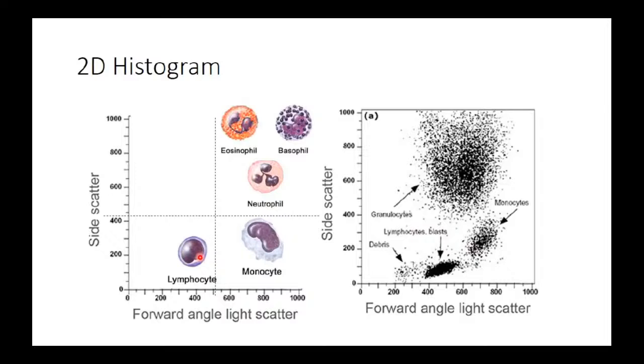Of course, this is a very useful technique used to count the cells and to analyze the phenotype and the health situation of the cells. And what's very special about this technique is that we can analyze many thousands of particles and cells per second. It's an easy technique. It's not very hard to perform, and it's precise. It's very widely used nowadays in all laboratories.